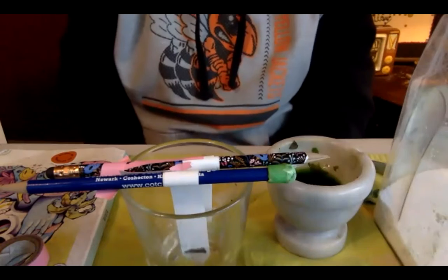This is getting silly. So that is just a function of the weave of the paper between the chromatography paper and paper filter. Yeah, coffee filter. Right, okay, I get it. The paper, right, like the matrix. Yeah, there's pores. Filter paper is meant to trap some and let some go through. So I don't know, there's probably a pore size that's different between the chromatography paper and the coffee filter. I imagine this one's finer. Yeah, makes sense. Coffee's just meant to separate those giant coffee grounds from the water, the liquid part.